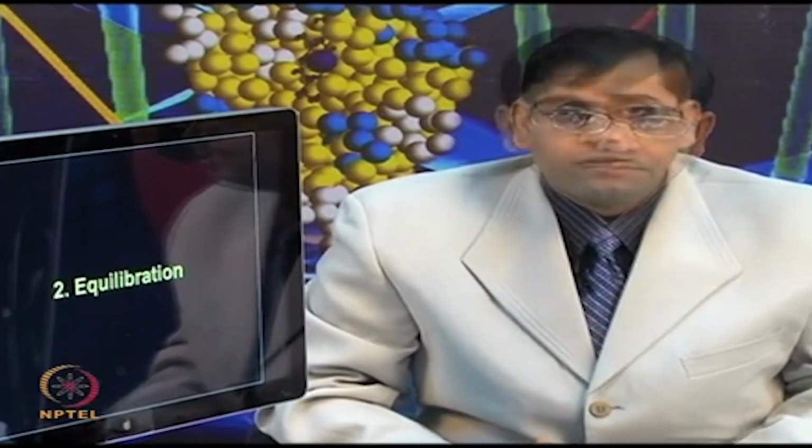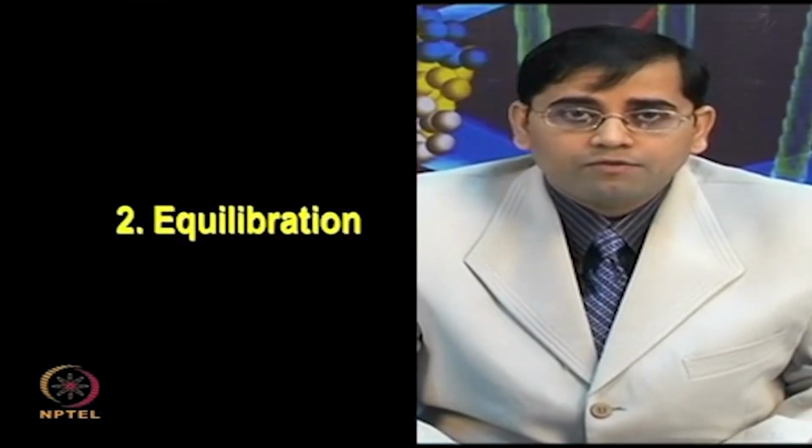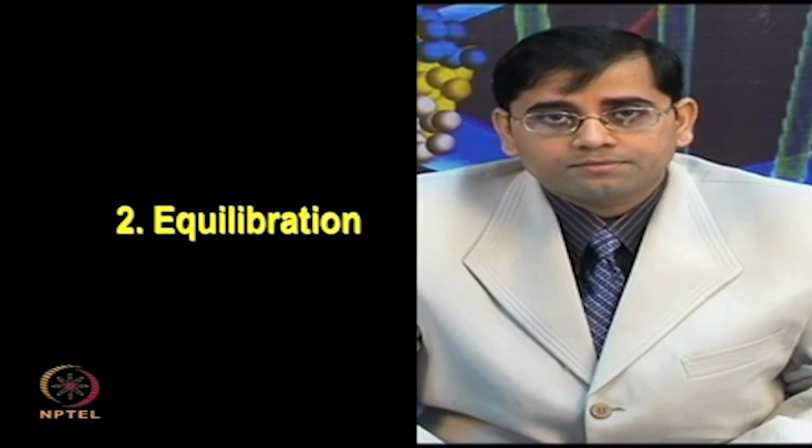You need to prepare your protein sample, which is already focused inside the strip in the first dimension. This IPG strip was already put in the electrophoretic unit in the IEF instrument, and after that you want to prepare it so that protein can be separated further based on the molecular weight. Now, you need to add SDS to provide the negative charge, and you need to do some treatment for reduction and alkylation.